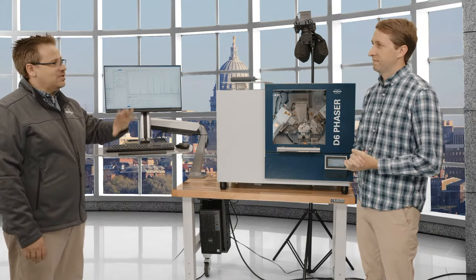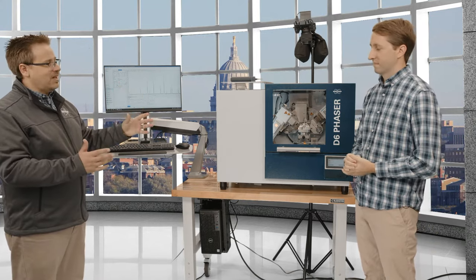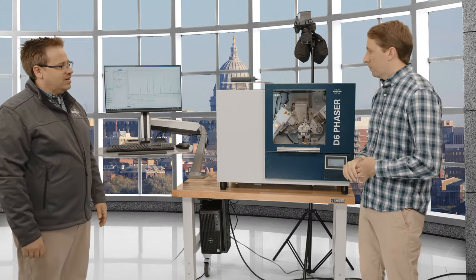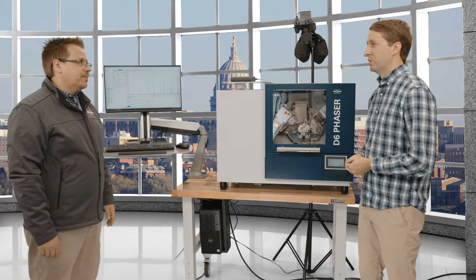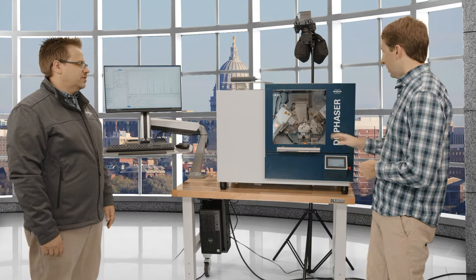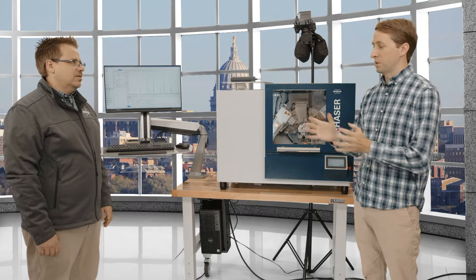It's like car engines, you know, if you wanted power, you had the bigger blocks, things like that. Now you got turbochargers, superchargers, ways to do these things more efficiently. Same thing here, huh? Right. It also comes down to infrastructure as well. That's true. Going back to when I was a customer, we didn't have room for a chiller and water lines and a high voltage power outlet. Yeah. So that's why we ended up with the benchtop. We didn't have a lot of space or infrastructure to host the larger systems.